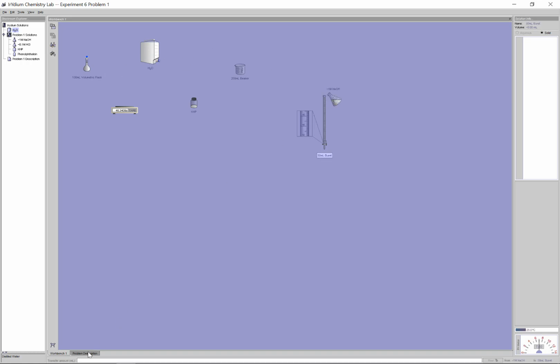And again, using that transfer bar on the bottom here, usually I just tell people fill it up more than half. The thing is, during a titration, I'm going to take down a starting reading. I'm going to slowly open and close the stopcock valve here. I can't reload my solution when I'm doing a trial, although between trials you're going to see we can reload it no problem. Because this could fill up about 50 milliliters, let's just pour in about 40. I don't really care the exact amount right now. When I pour in 40 here, it zooms in for me what the volume starting is.